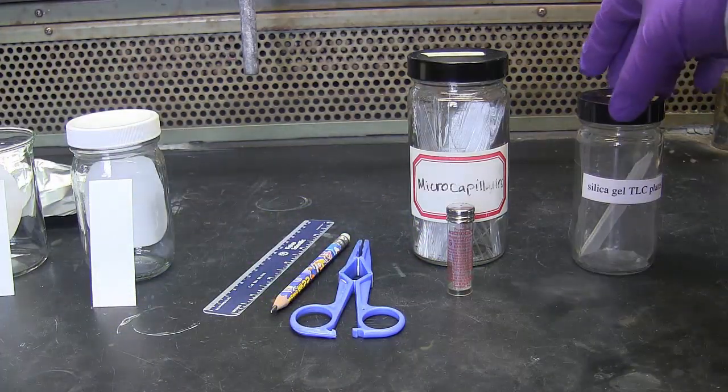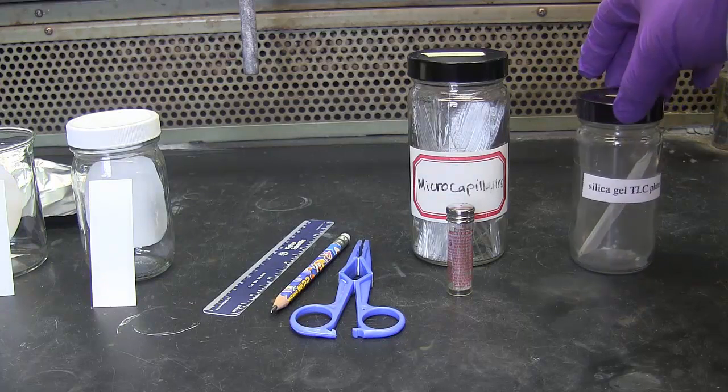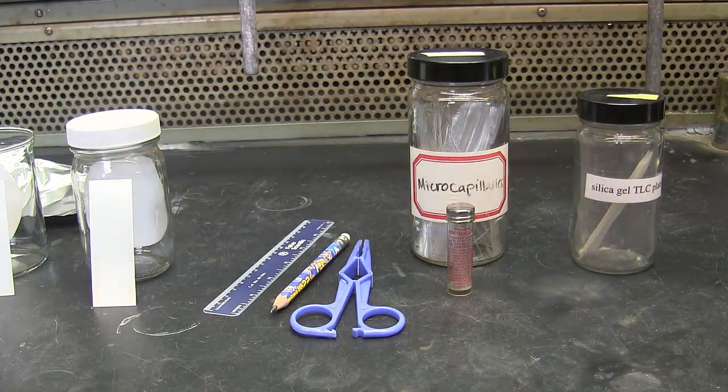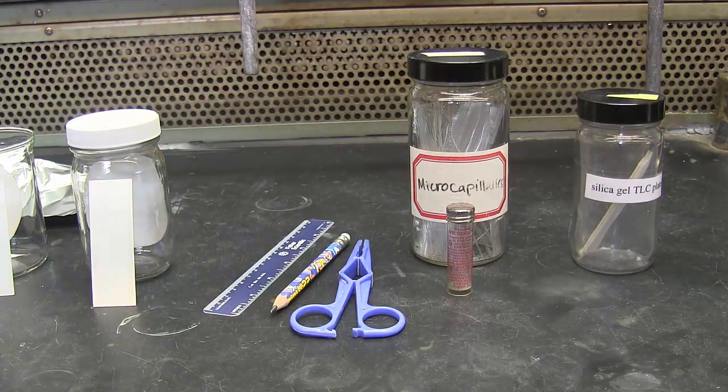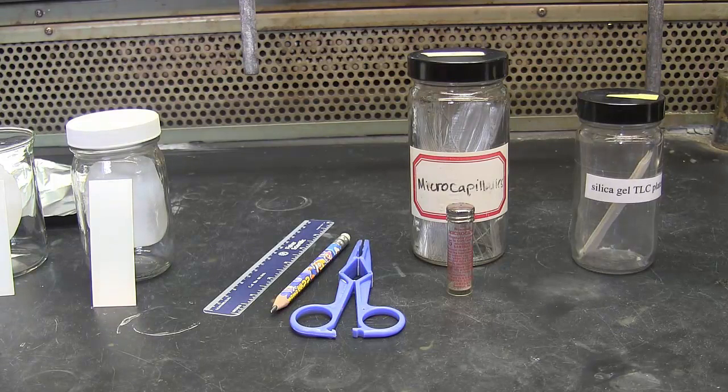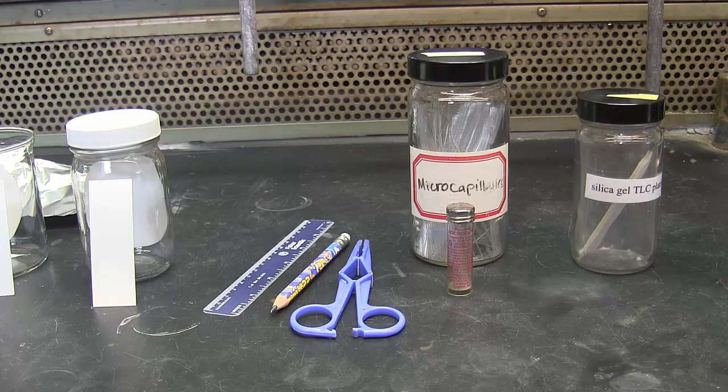You will find TLC plates set out in a jar in the lab. The TLC plates are hygroscopic, so please keep the jars capped tightly when you are not removing a TLC plate from the jar.